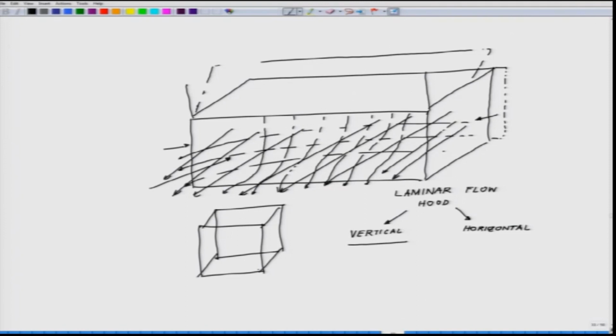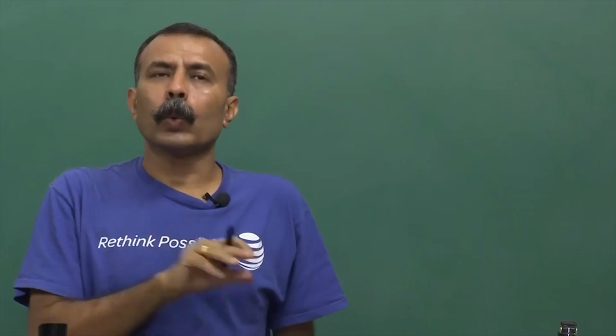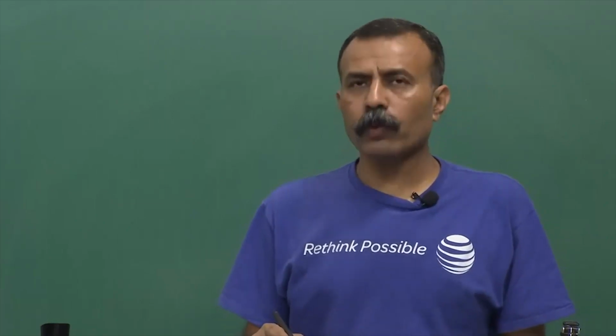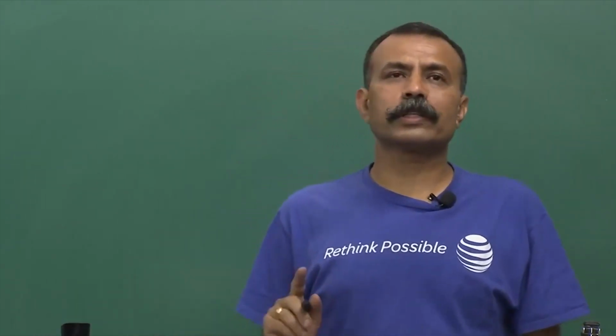These are the smallest ones, where one individual can work without disturbing anybody, but there is no option for a second person to sit in this. If you are clever, you could have 2 of them side by side, that way 2 people can work absolutely individually without disturbing each other.